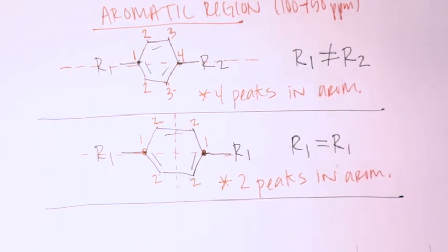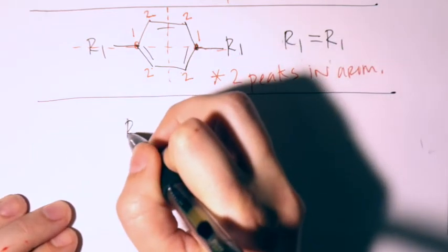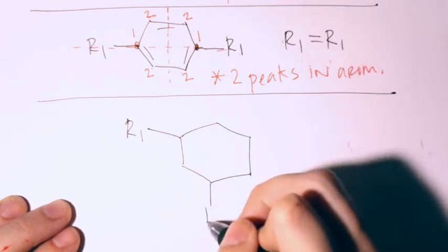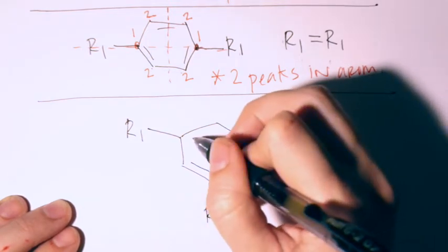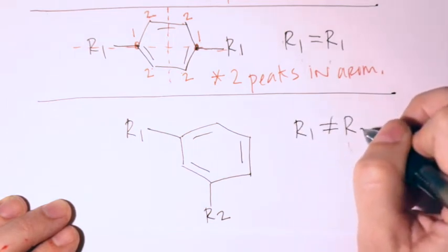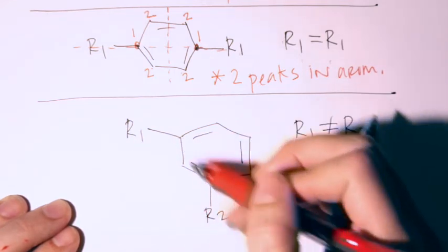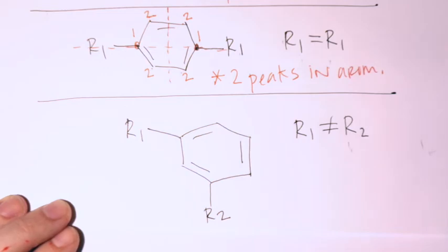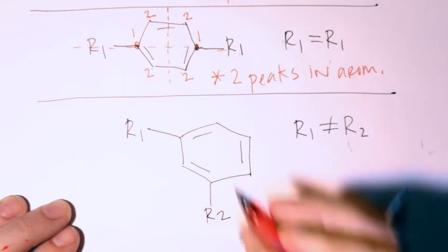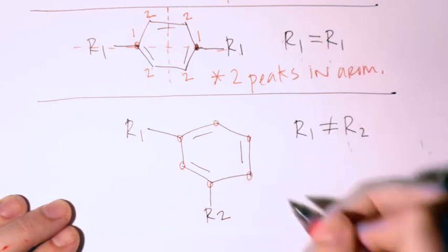So continuing with that, looking at other examples of aromatic substitution patterns. Again, here's another example where the 2 substituents are not equal. And so in this case, because these are not equal, there's actually no symmetry in this aromatic ring, because these 2 don't reflect on each other. And so now every single carbon is unique on this ring.